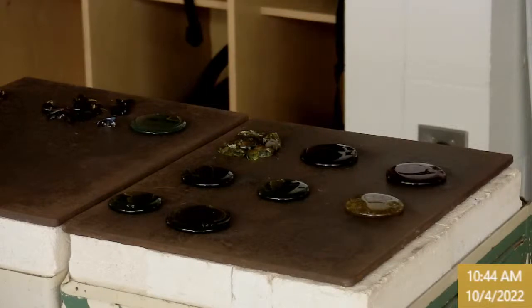What you saw down there, those techniques have been used for 2,000 years. So can you tell what color this is? It's kind of purple. And you know what metal that is? Manganese. This is manganese glass. You can tell just by looking at it. You'll notice that we have a piece over there that has the proper color characteristic to see. It's almost similar concentration to what they're using.